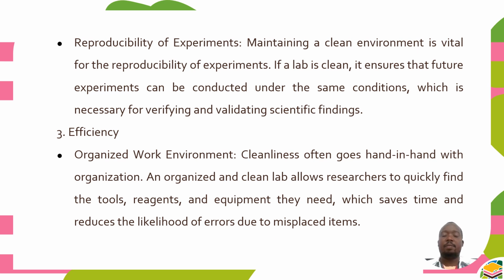Maintaining a clean environment is vital for reproducibility. If a lab is clean, future experiments can be conducted under the same conditions, which is necessary for verifying and validating scientific findings.